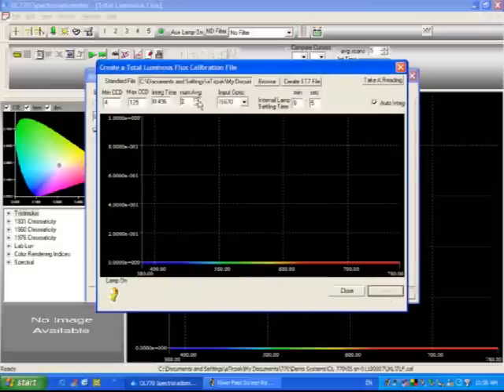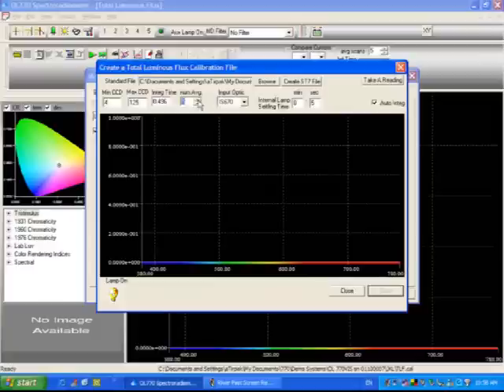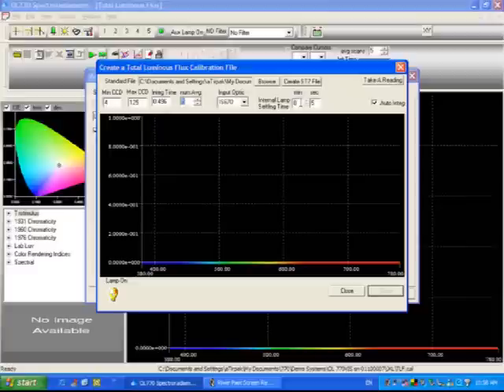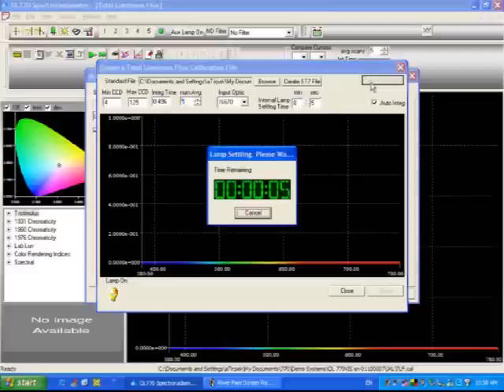I'm going to take just a few scans here for demonstration purposes. Also, the internal reference lamp settling time should be about two minutes, but for demonstration we'll just look at about five second warm up time. Standard file is loaded, simply click on take a reading.